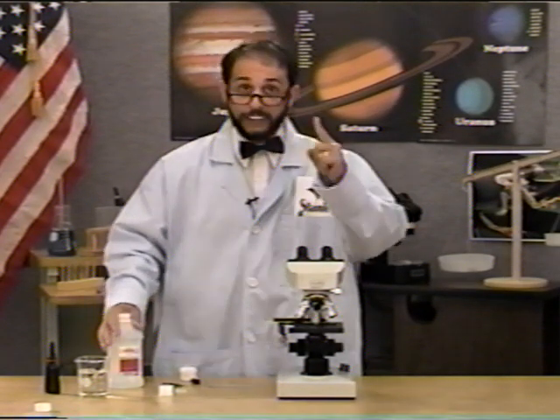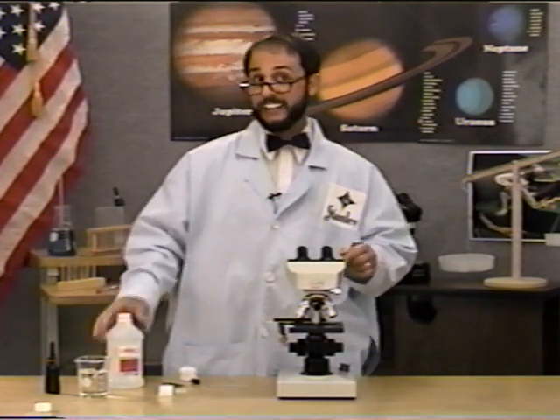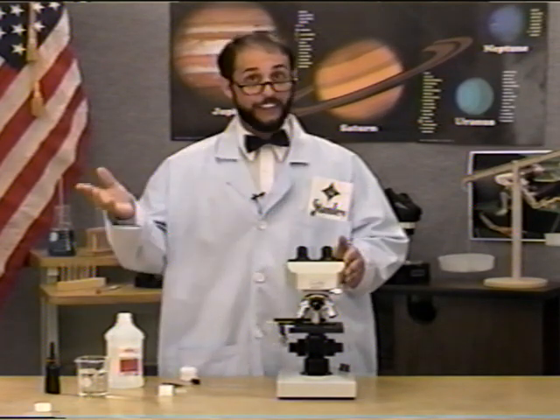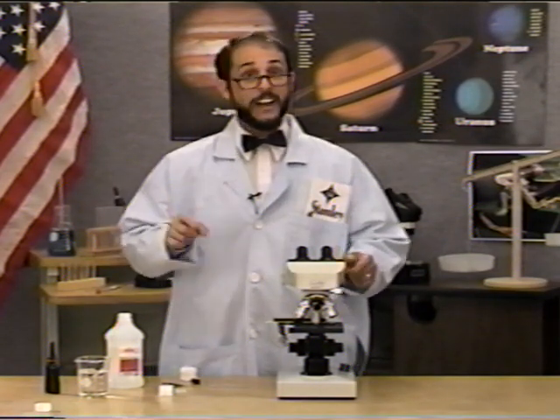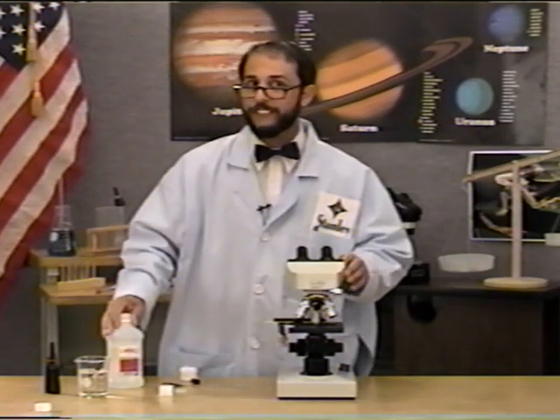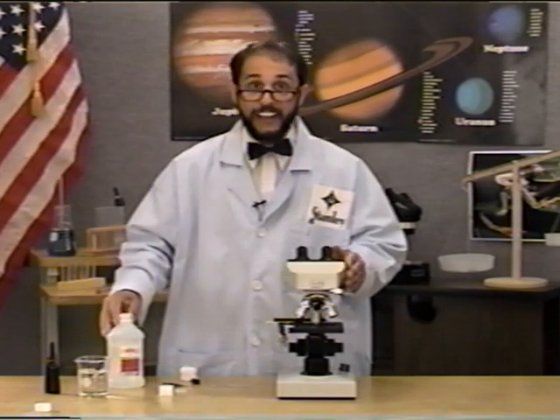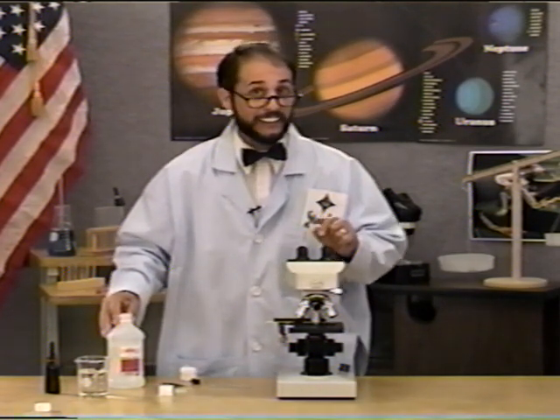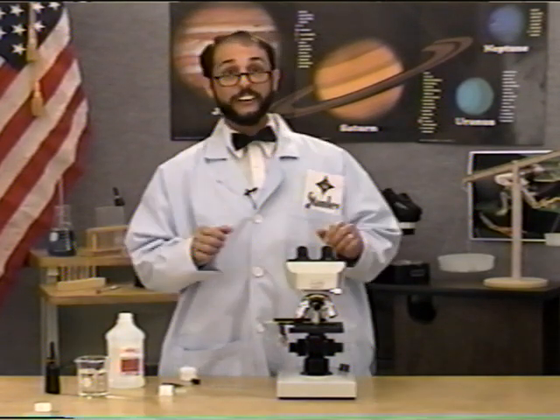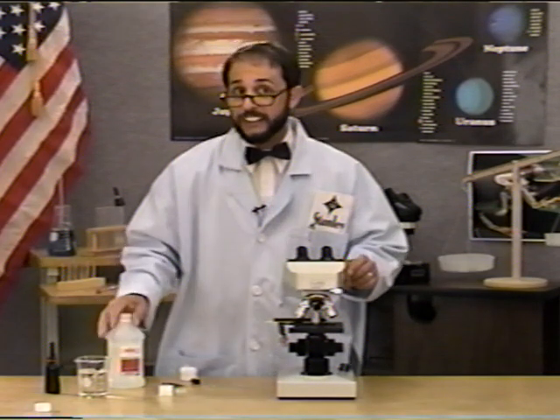One way that microscopes are used is in the medical field. Have you ever had to give blood at the doctor's office and then you wait for the results from the lab? Well, in the lab, medical professionals are examining your blood under the microscope. To know what they're looking for takes years of training, but one thing we know they see is cells, red blood cells to be exact, and so will you if you do this experiment at home. Make sure to have permission before doing it.